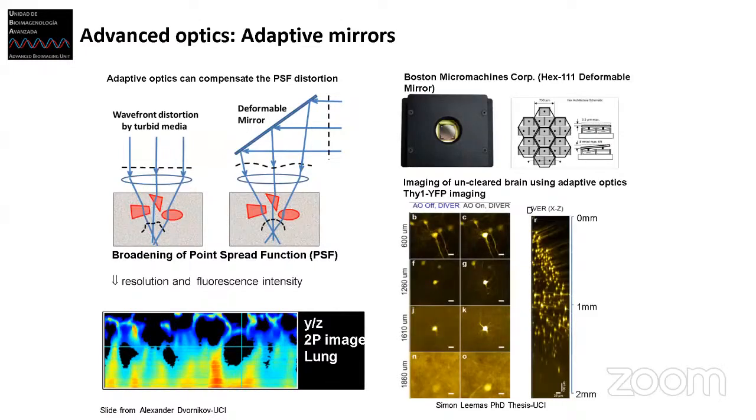So nowadays we have these little mirrors, which are composed of many small mirrors that you can adjust, and you make the beam pre-compensated in its wavefront to basically get to the same point, regardless of where you are coming from into the sample.